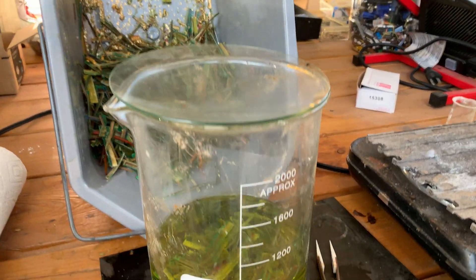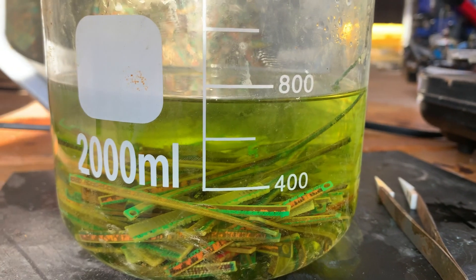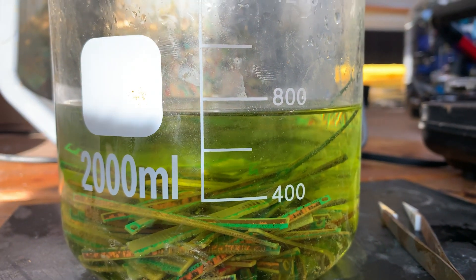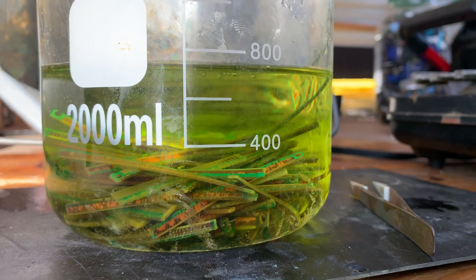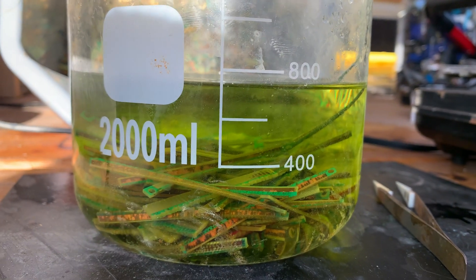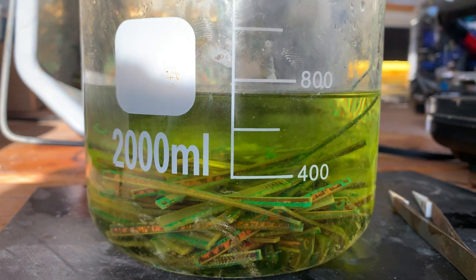We're going to zoom in real fast so you can take a look at this. We're just below the 800 mark — going to add a few more fingers to this and get it cooking. You can see it's already starting to react; those bubbles are working their stuff.